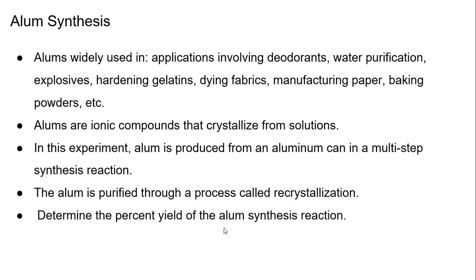Okay, so alum synthesis. Alums are widely used in tons of applications, with deodorants, water purification. You get the idea. It's in everything. I honestly had never heard of alum until I had to present it for my class in lab. So this is a good lab that, if we had been in person, if you ever thought of being a chemist, this is a good lab to get an idea.